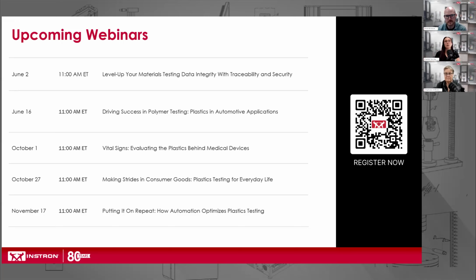It's just not complying with the standard, so that's where we fall into some rough waters. It's not complying to the standard, but yes, it is very accurate, and it's very okay to compare your results internally from a batch from this year versus a few months ago versus a year or two ago.